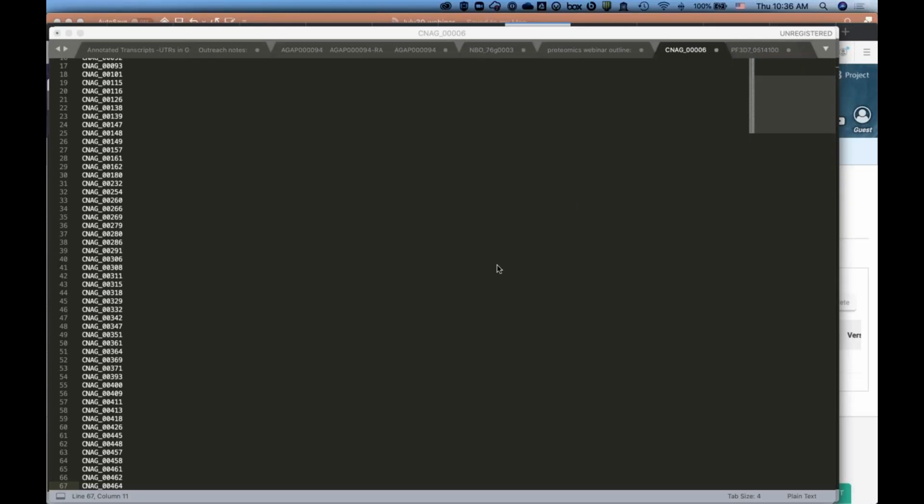And I'm going to try and answer a question that came in. The question was about analyzing one's own mass spec data and then comparing it to data in the database. Unfortunately, right now you can't do that. We don't have a pipeline where you can take your raw mass spec data, your peak files, and then do a research of the proteomics database to find mass spec hits. That's a bit too compute intensive to run on the fly like this. There are mechanisms out there and something potentially worth investigating in the future, but for now that's not possible.